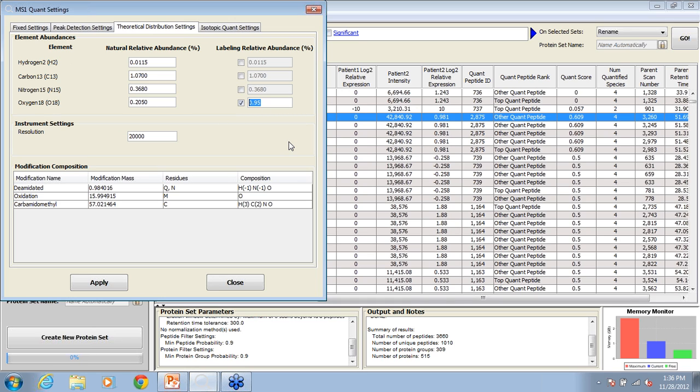But James, I need to interject so we don't confuse people. That's already a percent. Right? So what you have is 0.95% right now. It just should be the integer. Oh, that's correct, Art. Thank you very much. That's why we have backup. So just type in the straight percentage here.